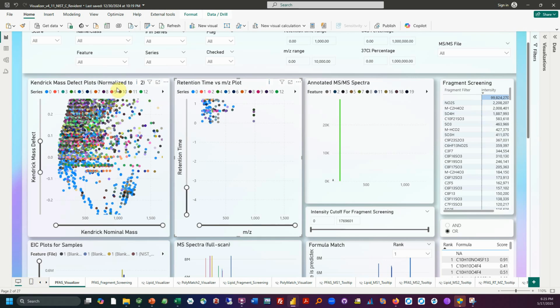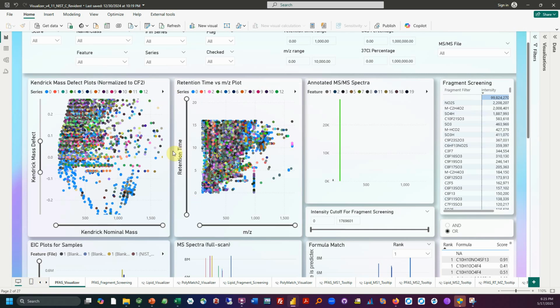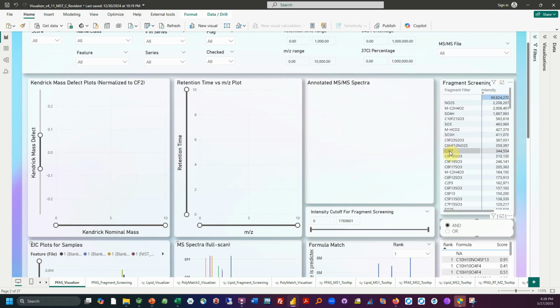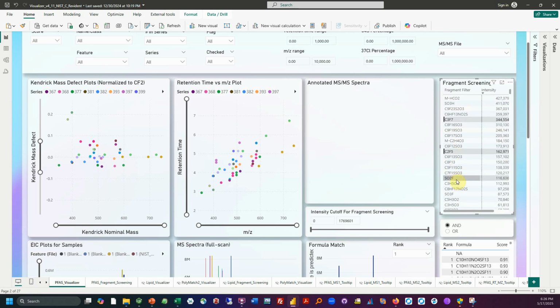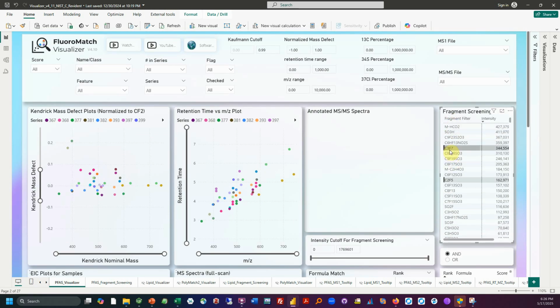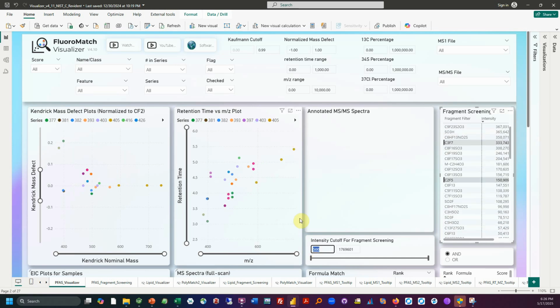Do you know when you unclick and unfilter many compounds, sometimes that will lag your computer depending on how high performance your computer is. So let's say I do want something that has C3F7, but I want to be very confident that it has a carbon-4 chain. I can do an AND, and then I can click the C3F7 and C2F5, and if I wanted it to be even bigger, I could select more chains along here, and so this is a more selective process, right? You can be fairly confident, especially if they're above high signal to noise, that these are PFAS.